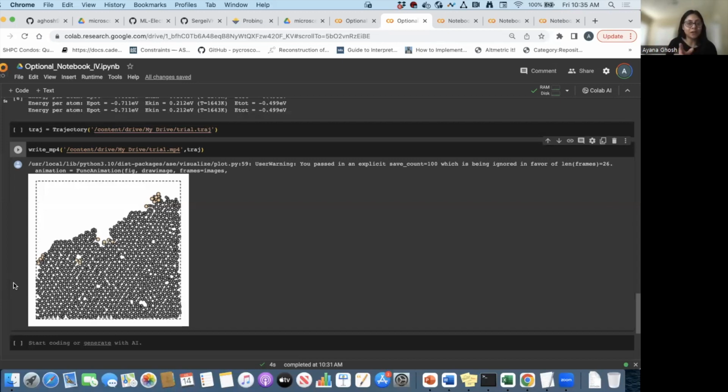So this is not a trivial thing to do. Make sure you're identifying the atoms correctly and looking at the perspective to see what really is getting recognized. And if you're going to use this utility to create a simulation object, you have to make sure your coordination and the boundary conditions are satisfied. When you're doing this, the periodic boundary condition is given automatically in every direction, and that may not always be true. So you have to keep that in mind.